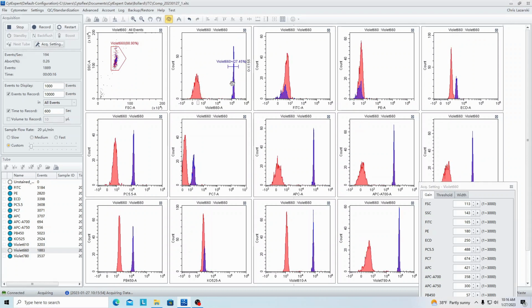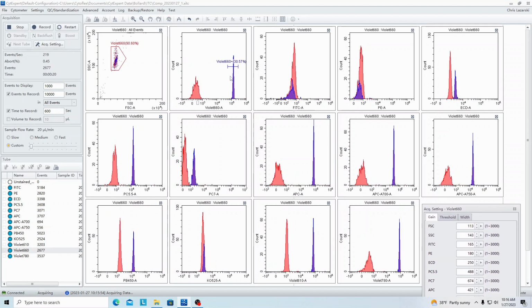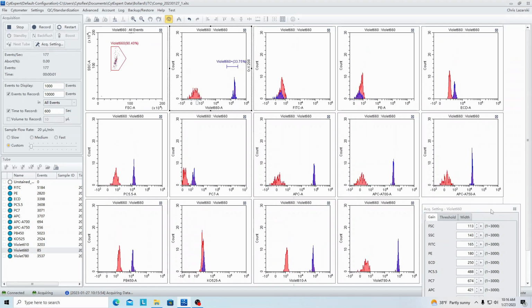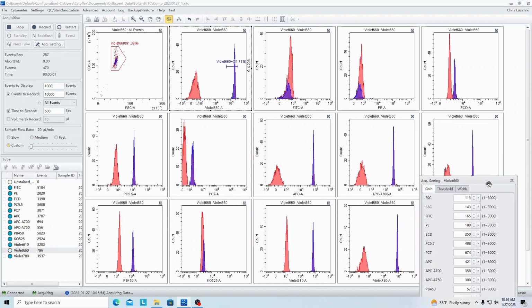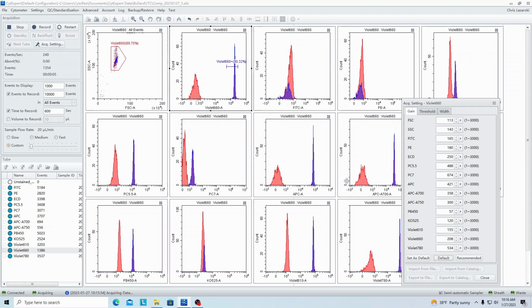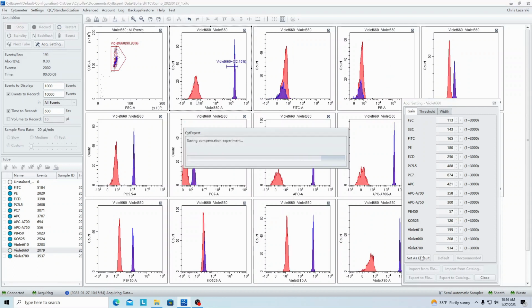I probably would recommend just a nudge up. I'm just basically going to try to shoot for the first tick. So in the end, it's a 208. So we will save that as our default and make one last check.